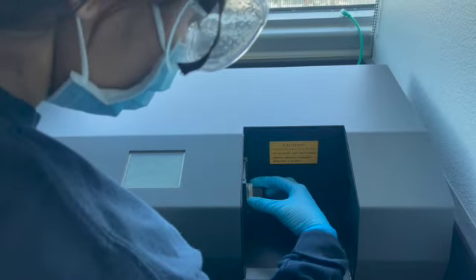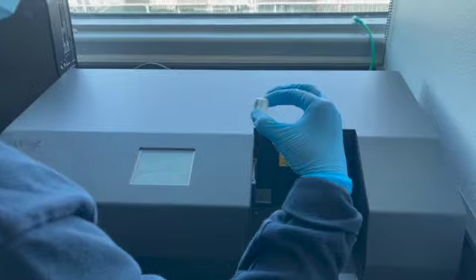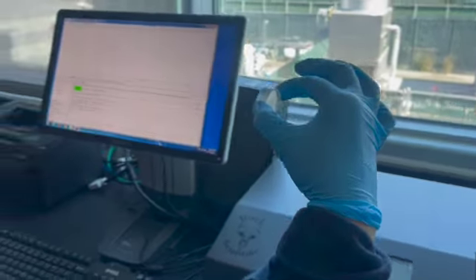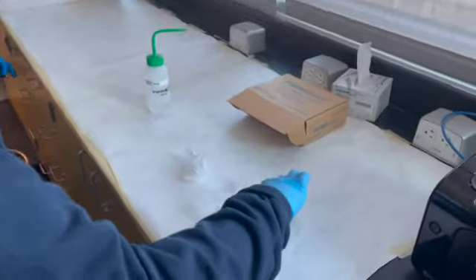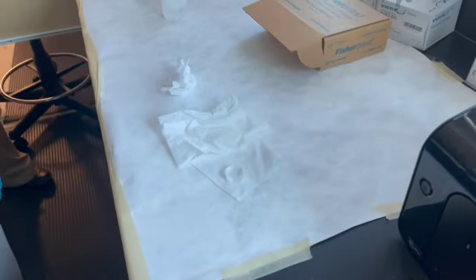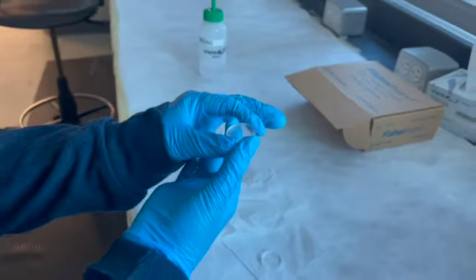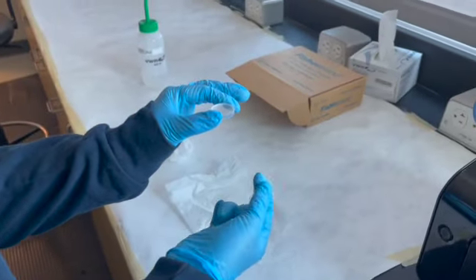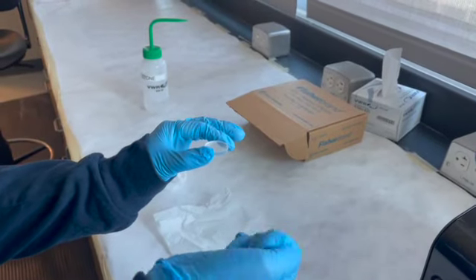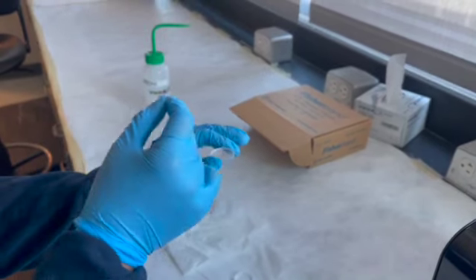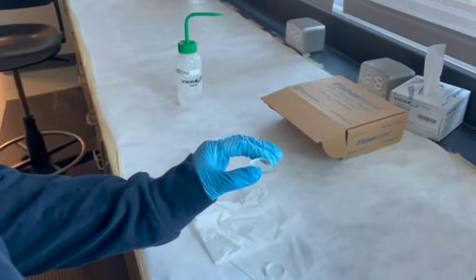After we use the machine to blank this, we're going to put our salt plates, touching them on only the corners, onto tissue paper. I'm going to take one of our salt plates and a Pasteur pipette with our solid solution in acetone and gloss it over the salt plate, then shake it around a little bit.